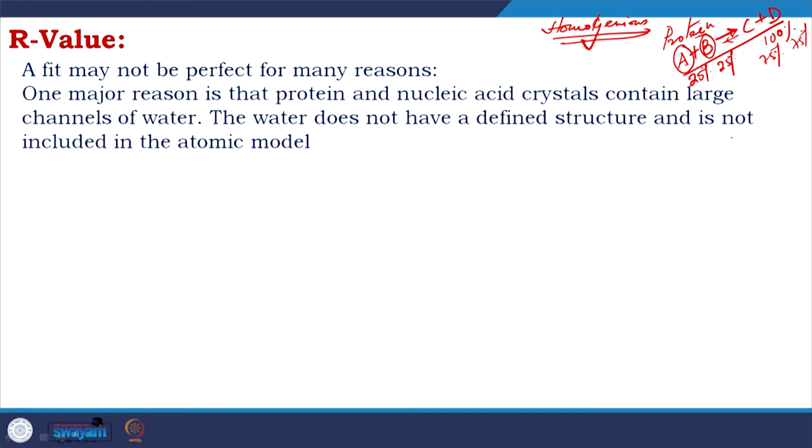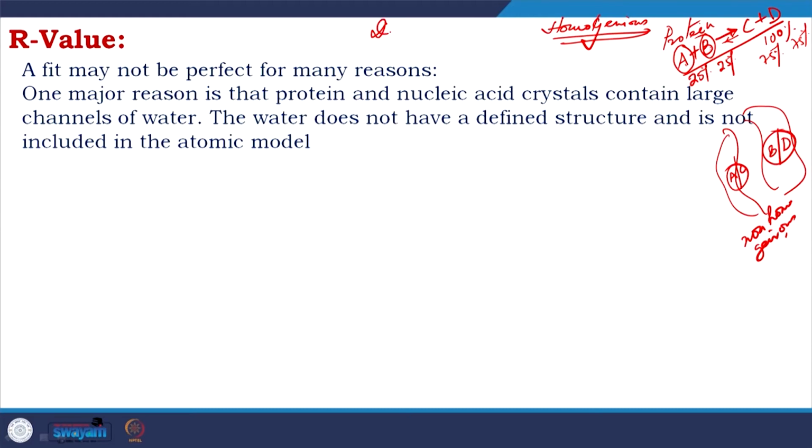So, now if you imagine your active site of the protein, in one side there would be A and C competing, in other side you have B and D competing, and that would create a non homogeneous environment, and nearly it is impossible to get crystal in this situation. So, what to do? General strategy is to use what we call dead end complex.